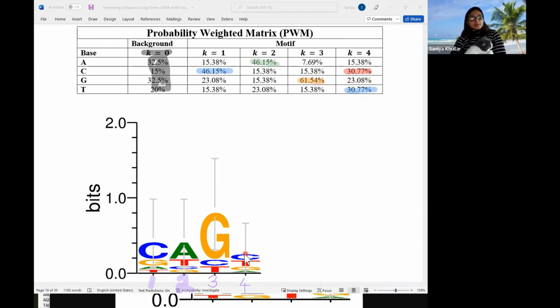If something's at the top, it can either be the most frequently occurring, as is the case here, or it can be tied with the next base. The second base would not be the maximum. If it's in the second position, it's either in the second spot or it's tied with the first, for instance. That's how you can interpret it. So if a base is at the top, it is either the highest probability or it's tied for the highest. In this case, it's tied.